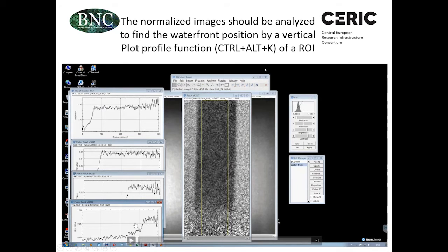And then we check wherever this average value is reached. And this will give us a pixel coordinate that you can read from the bottom axis, which will be a dimension-like, distance-like quantity. And this will be used for the further processing.